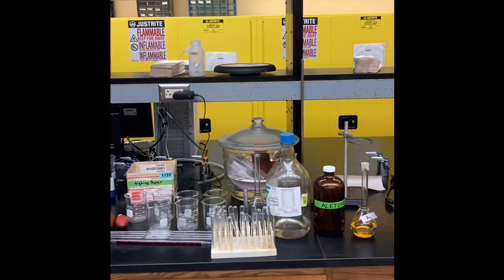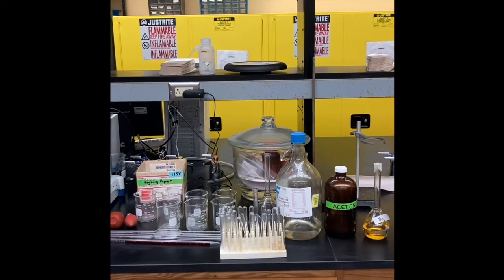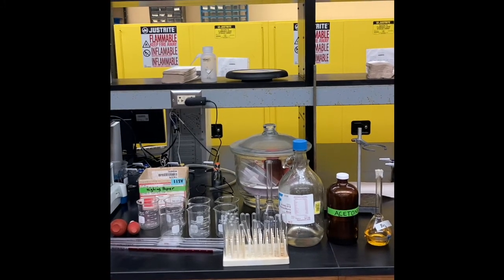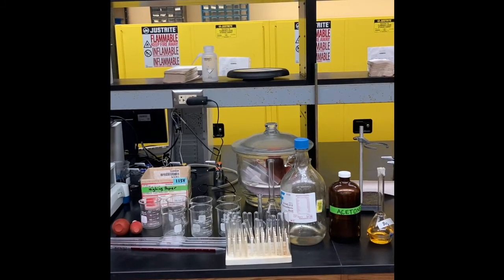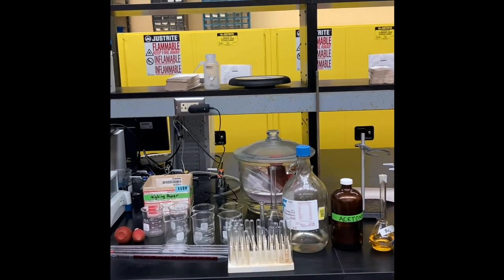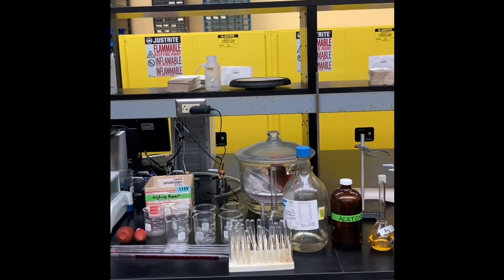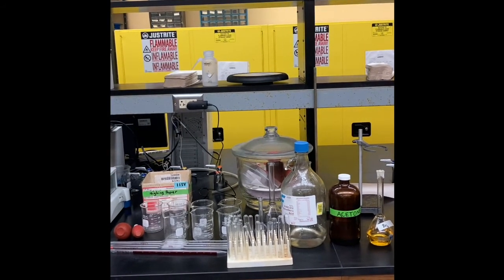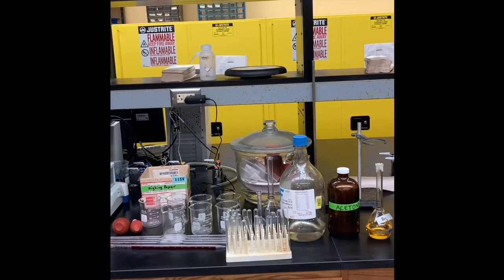So to prepare this experiment, we need to prepare 7 different solutions of the mixture of hydrochloric acid, acetone, and bromine, which will be different in concentrations of hydrochloric acid and acetone. We use this glassware to prepare these solutions.